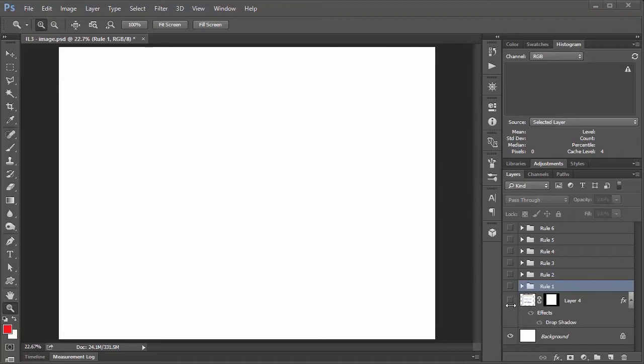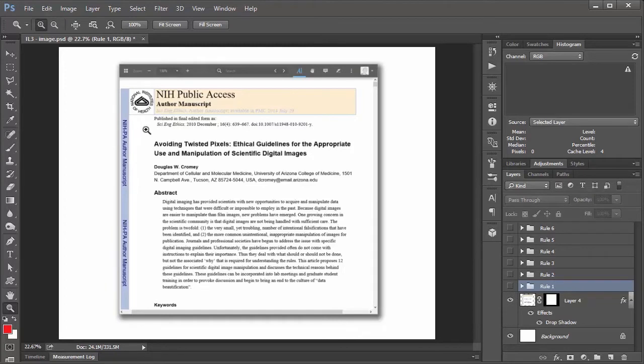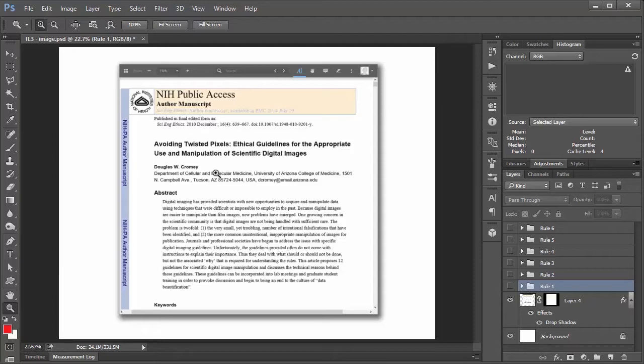So the basic game plan here is that I have this paper published in the Journal of Science and Engineering Ethics in 2010 by Douglas W. Cromey. And in this paper Mr. Cromey outlines 12 basic guidelines that you should be trying to follow anytime you're working inside Photoshop or any other image manipulation program with your scientific data.